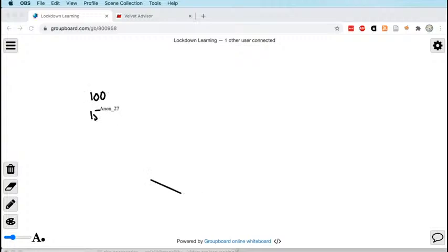So here we've got a small number of contigs of different sizes. That will do. Okay, so there we go. So we've got a small number of contigs of different sizes, and we want to know what the N50 of this assembly is.